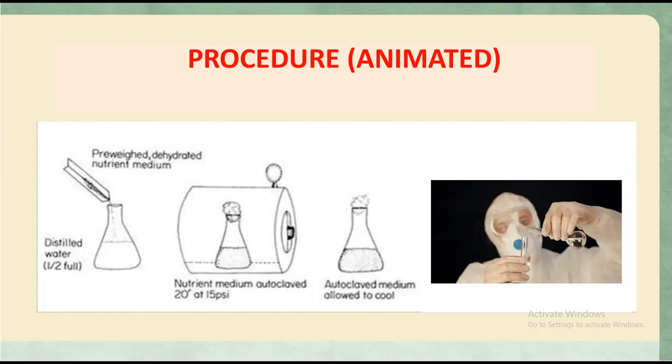Okay, it will never be solidified; it will be in liquid form. So what will you do? You will add the powder, and after that you will place the beaker in the autoclave in order to kill all the bacteria and all the spores and all other types of microorganisms that are present in that water or on the beaker. And you should also sterilize the test tubes.